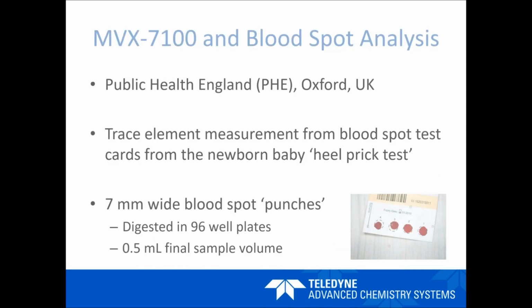Just a specific example in clinical or biological work: we have a customer at Public Health England in the UK who has been working on blood spot samples with the MVX system and ICP-MS. In the UK and in most parts of the world, there is what we call the heel prick test, where blood spot samples are taken from newborn babies after they're a few days old.